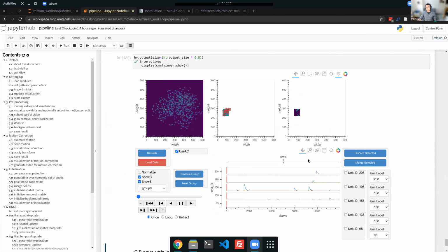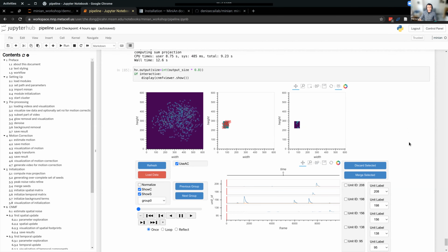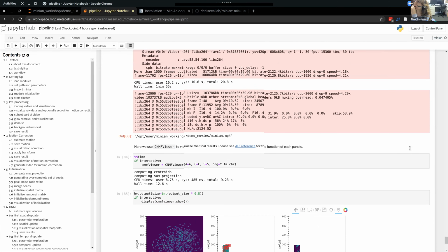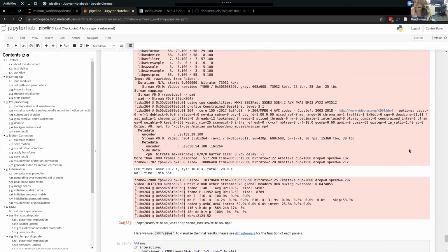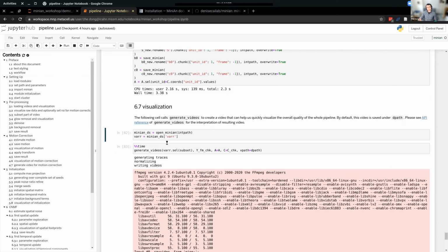I see a question. Is it about the viewer, or can I take a question now? I was never able to generate that final video. Is that because of that one cell missing that you just mentioned? Do you know what the error was? I don't have it right now, but it wasn't able to generate the video. Was it something like a variable not defined? Maybe I can open one of the previous notebooks and let you know later. Thank you. Okay, I mean, it might be just that.